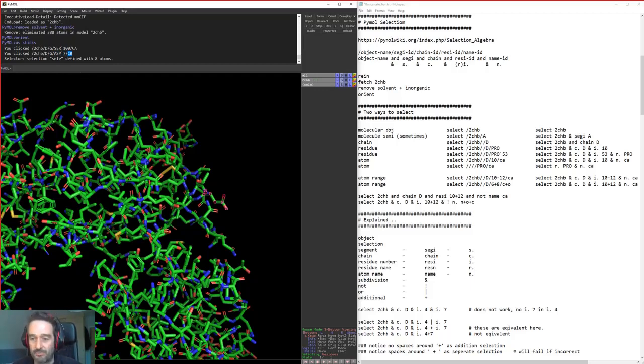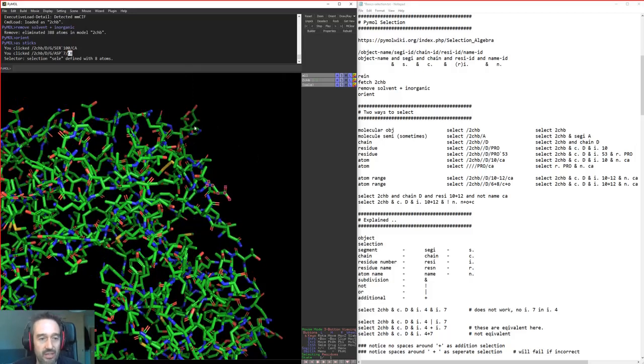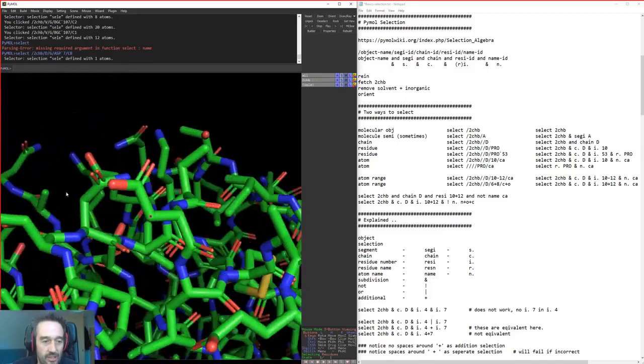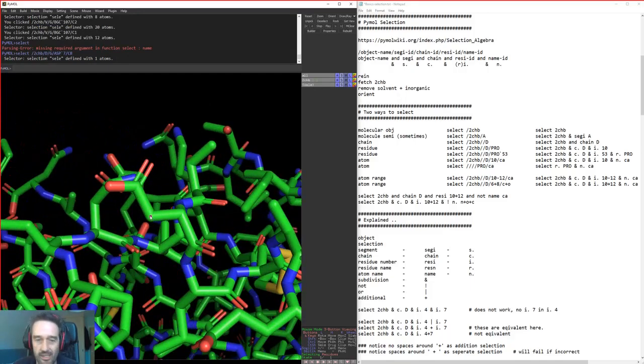and the atom that I clicked on, carbon beta. So what I can actually do is deselect, reselect somewhere else, and type in the word select, and copy that selection that I'd made here, and turn on my selection. You can see that I've reselected the atom that I had initially clicked on, as it has a little pink box around it.